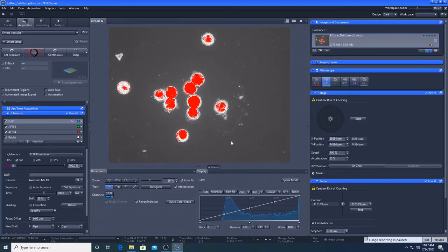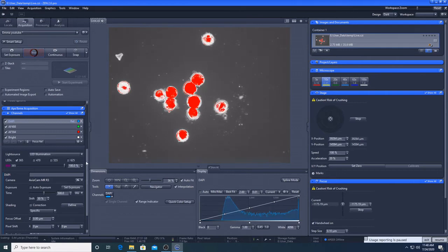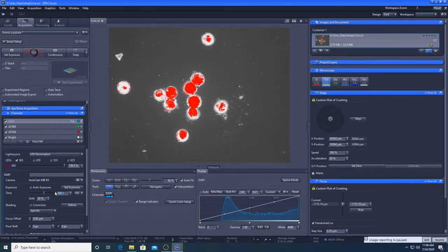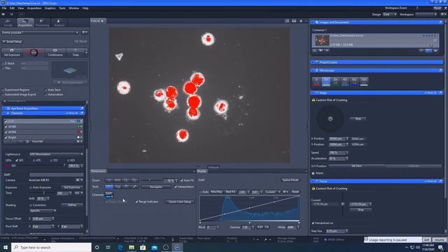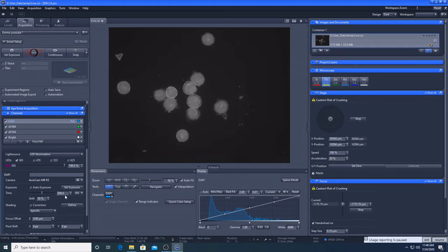I am now going to leave the light intensity at 100% and take the exposure time down. This would be a usable image, but I will take the exposure time down lower as I do not need to fill up that much of the histogram.